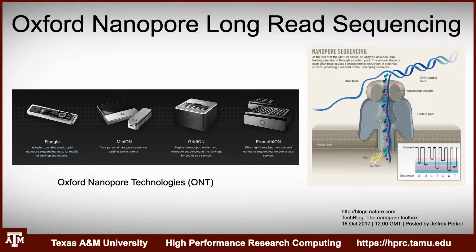So any questions on nanopore sequencing? It's really interesting, and it's fairly inexpensive. If you have an experiment that you can maybe utilize this for, it's something that you can do in your lab on your laptop. So it's really kind of exciting.